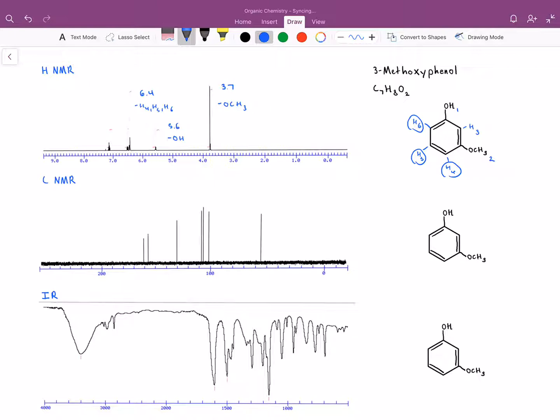That leaves us with our final hydrogen, which is the one we labeled H3, as the final peak showing up at 7.1. Besides the process of elimination, that hydrogen is also — not only is it coming off a benzene ring, which means it typically has a higher shift value — it's also stuck between two carbons, which I'll circle in green, two carbons that are highly deshielded because they are directly attached to oxygens. So the combination of it being attached to a benzene ring as well as being between two highly deshielded carbons is the reason why that hydrogen is showing up most downfield at 7.1.